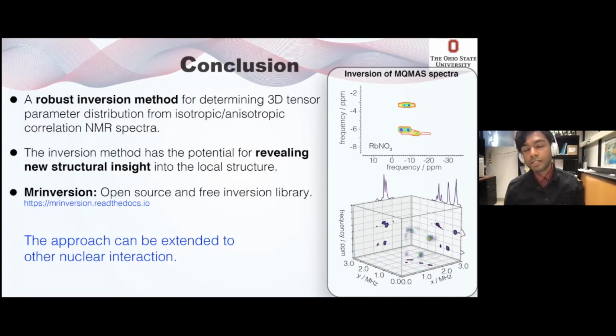Again, it's doable. I'm not sure how well defined or how accurate the solution is going to be, because your solution has to be a lot more regularized, going from 1D to a 3D distribution. And I don't think my computer can handle that kind of massive matrix. But theoretically, you can use the same kind of setup to get to that solution.